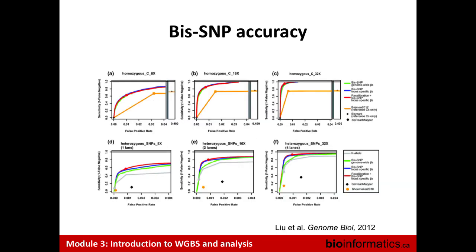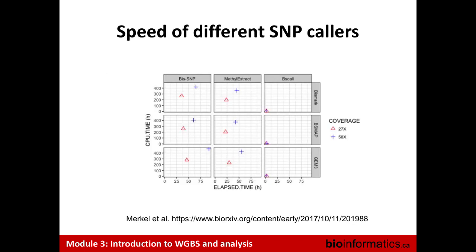And maybe this is not so critical, BISSNP accuracy and so on. So you have that in the slides if you're interested. As I mentioned, I have a few bonus slides. So this is another of the bonus slides coming from the GEMBS paper.